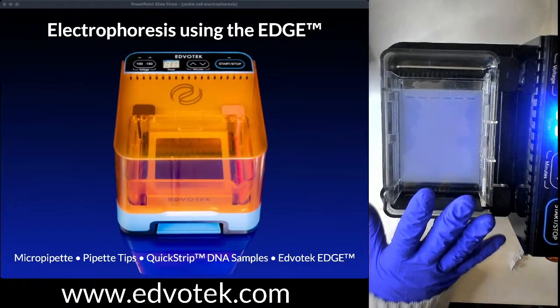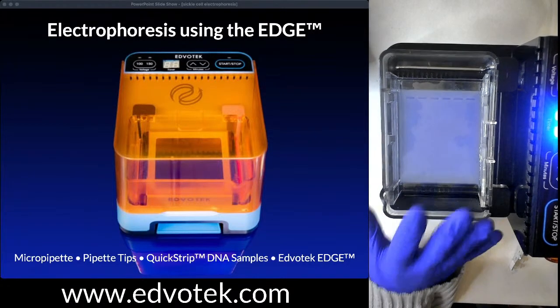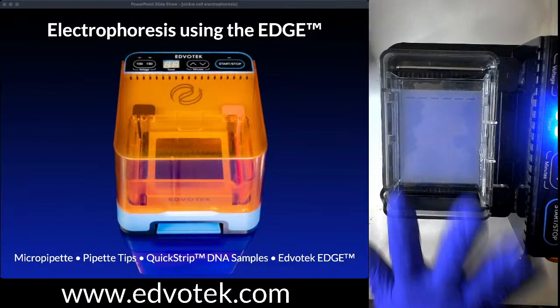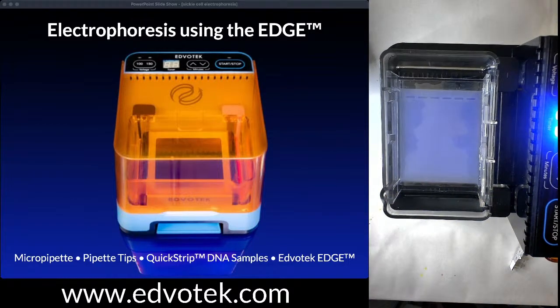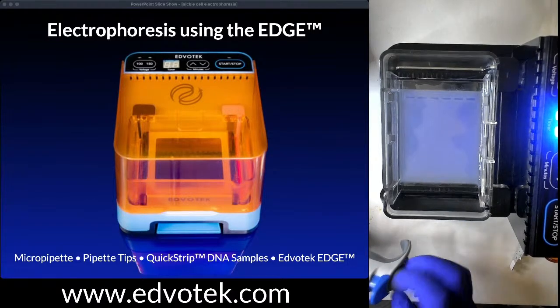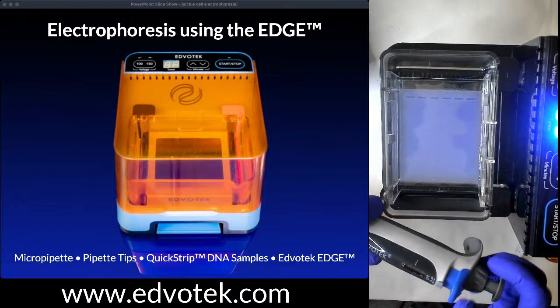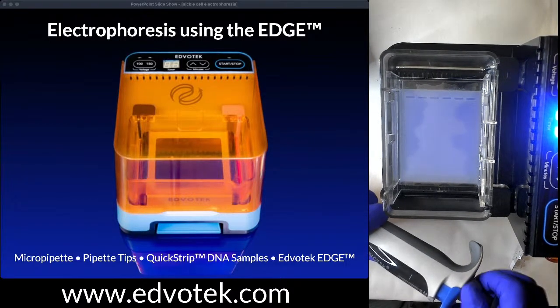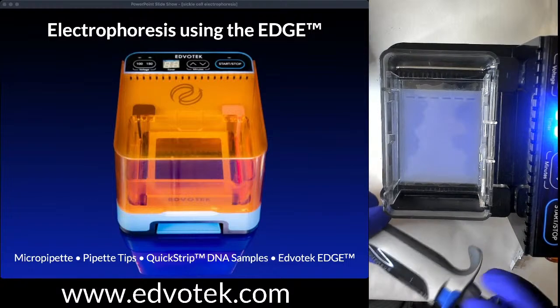There are two reasons to use buffer instead of water. First, we are using electricity to separate the molecules. Water is a super poor conductor of electricity, and the salts in the buffer mix with the water, which allows our current to flow. And next, again, because we are using biological samples, we've got to keep them at the correct pH for them to be stable and also to have a charge to be separated through our gel.